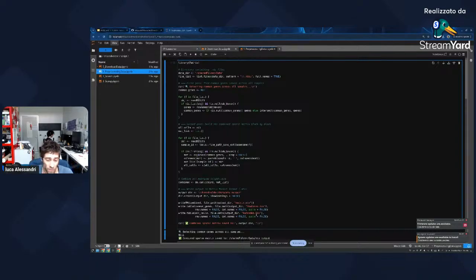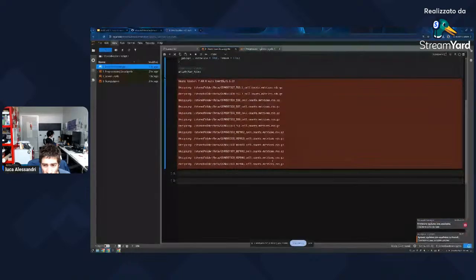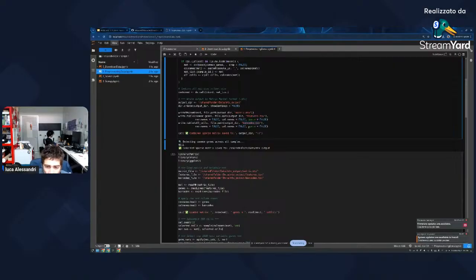So if you want to use other clustering algorithms, you have to convert this type of data into an MTX or a dense matrix or something like that. This is how you use this code. Once you convert this, all of your data are in one MTX, TSV, and TSV file. Here I'm merging everything, all my samples, as you could see from here. We have several datasets, so I'm merging all the datasets in one MTX, feature and barcode file.